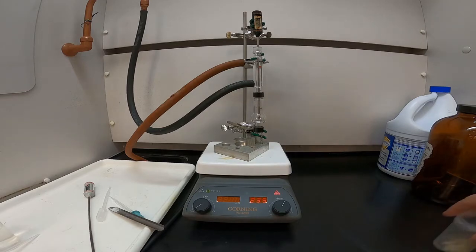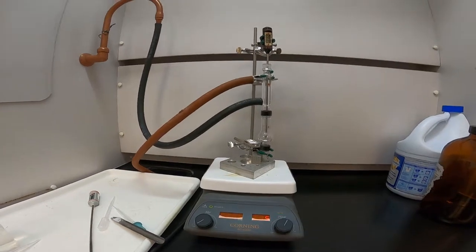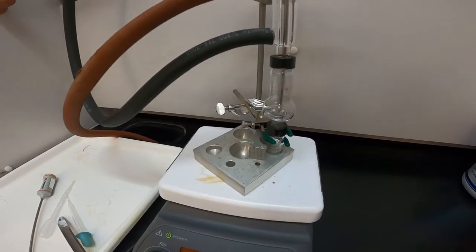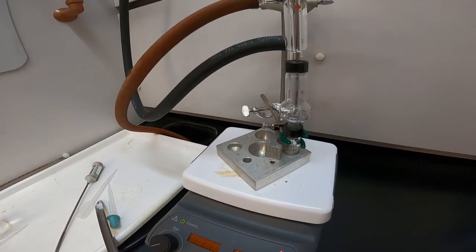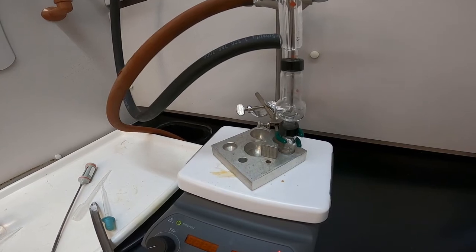The sample's been heating now for probably about 20 minutes. It's taken quite a while for the vial and the contents and the apparatus to get warmed up. So I'll zoom in a little bit. You can see the contents in the vial are boiling, bubbling in there.